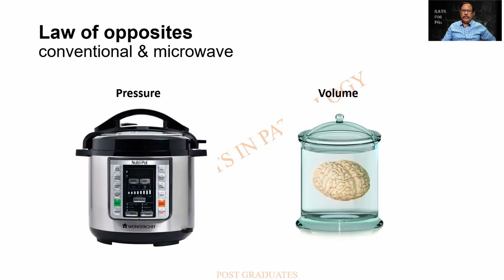For the next few slides, I shall be wandering with some slides with which we shall be trying to find a way to unknown destinations. This is a pressure cooker ordinarily used for cooking, in which the cooking is dependent on the amount of pressure that is created.